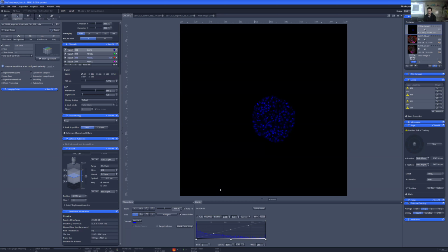Are you guys able to hear that? We were not. If you wouldn't mind restating. Yeah. You might have to speak louder or come closer to the microphone. Yeah, I think so. So there's also a fan running in this room constantly to help cool off the microscope. So this student is, we didn't hear a single word. Oh, no problem. Either if they'd come closer, or Mr. Woodbury, if you'd restate.